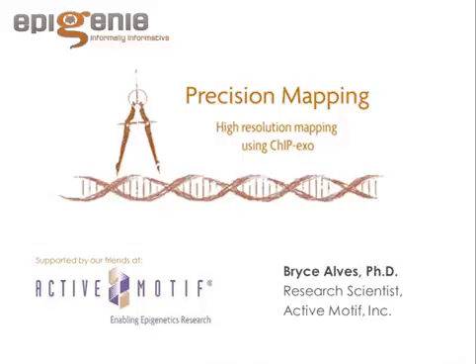If the antibody is purified and its concentration is known, you usually use about 10 micrograms of antibody per reaction for 50 million cells. If it's a polyclonal that is unknown, you're basically just going to have to guess because you don't really know the concentration of antibody binding there. So to hedge our bets, we usually use about 15 to 20 microliters, assuming that it's probably polyclonal and there are a lot of clones that will bind to our target.